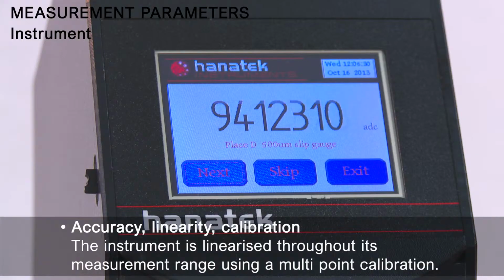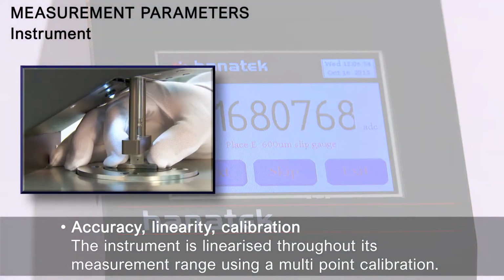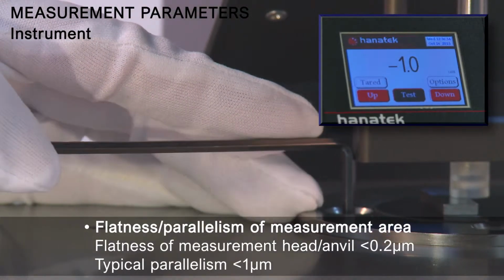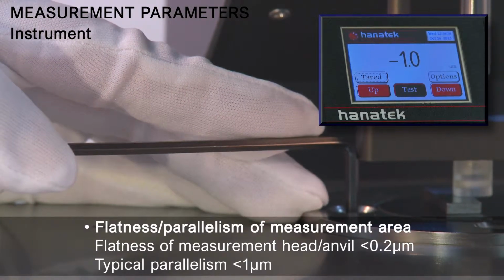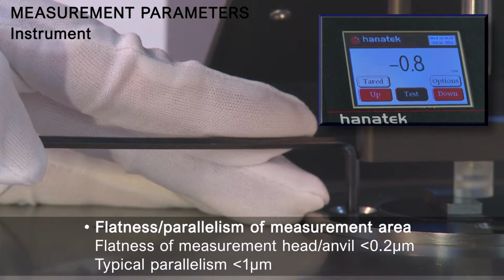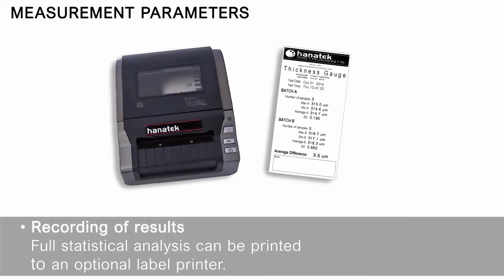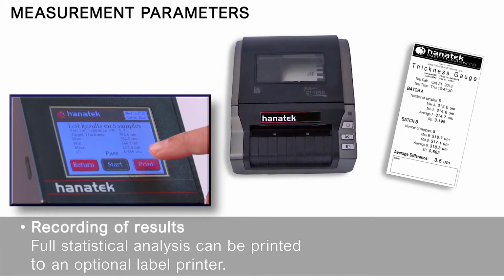Instrument: accuracy, linearity, calibration. The instrument is linearized throughout its measurement range using a multi-point calibration. Flatness and parallelism of measurement area. Flatness of measurement head and anvil less than 0.2 microns. Typical parallelism less than 1 micron. Recording of results. Full statistical analysis can be printed to an optional label printer.